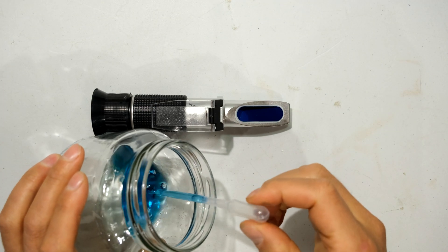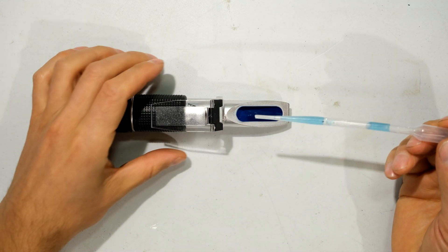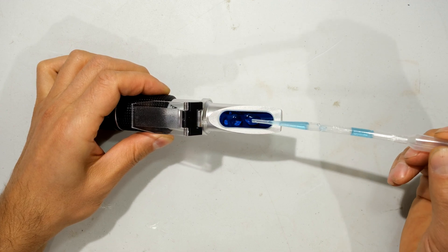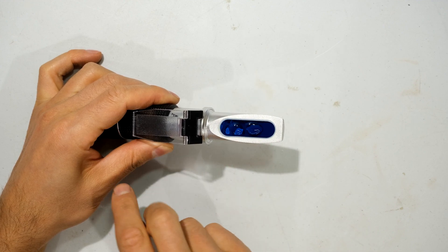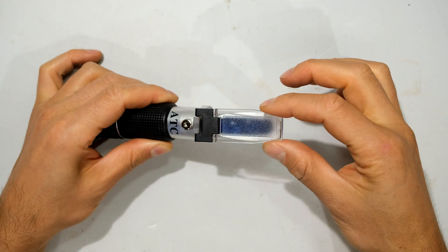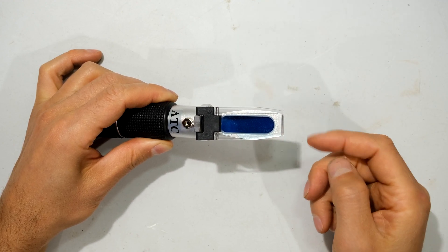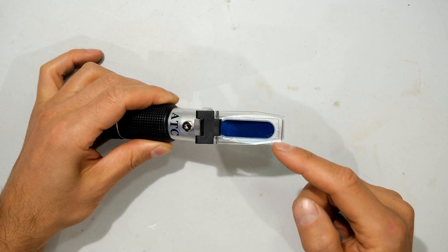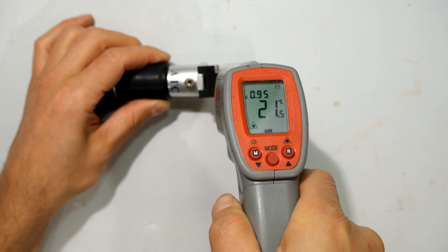I take my dropper — you only need one to two drops on the prism. Make sure there are no bubbles, then close the daylight plate. Leave this for 30 seconds; we want the temperature of the solution to reach the temperature of the refractometer.